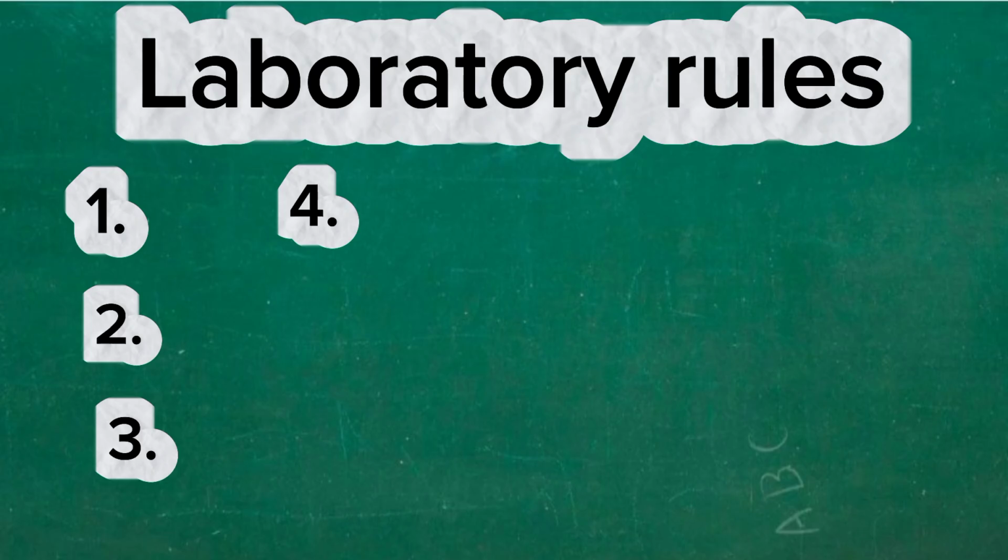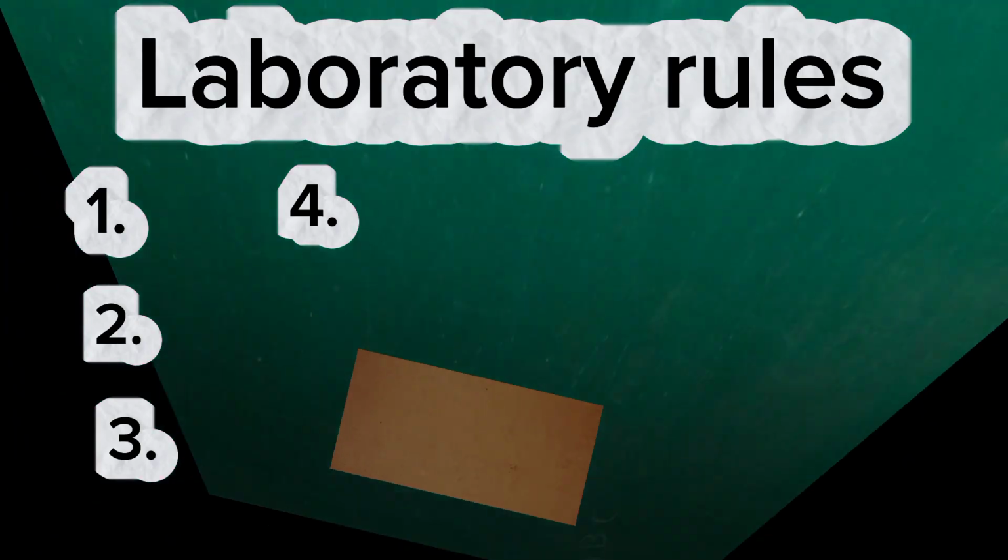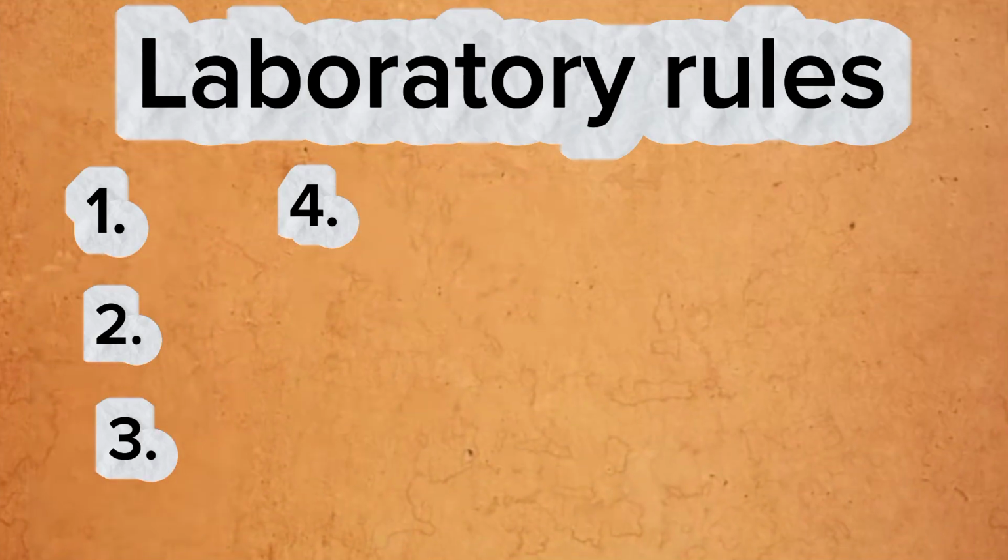If you have long hair, tie them back. Unaona, kama kuna nywele ndefu zifunge pande ya nyuma, hakikisha kwamba hazijafunguka, otherwise zinaweza catch fire. Usiende pale na nguo ambazo zinapeperuka na upepo, maana zinaweza catch fire.